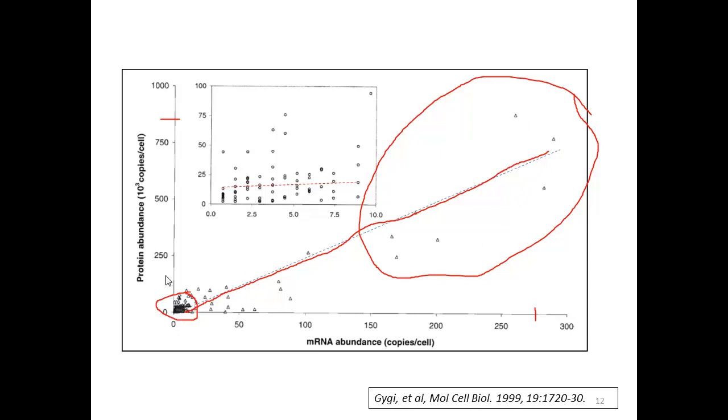And here I've shown a blow up a little bit of this area down in here, and here you could draw, based on these, a very different line at a very different slope. But because these 7 peaks happen to be where they are, we've drawn a very particular line, and to the eye that looks quite reasonable. But again, I want to warn you that correlation coefficients are dominated by extreme values.